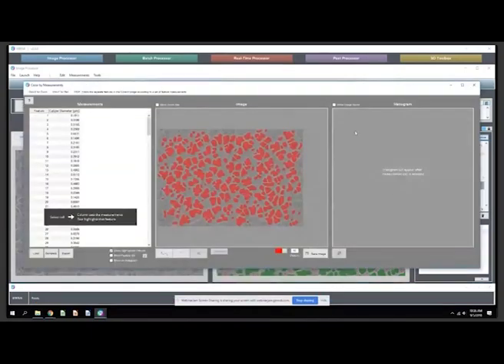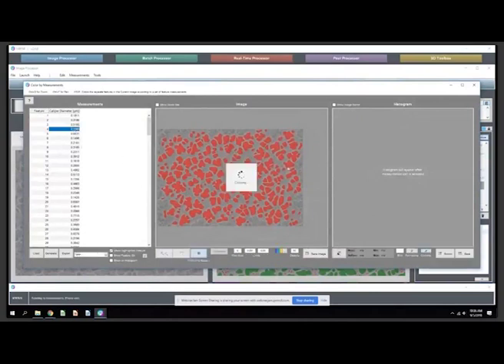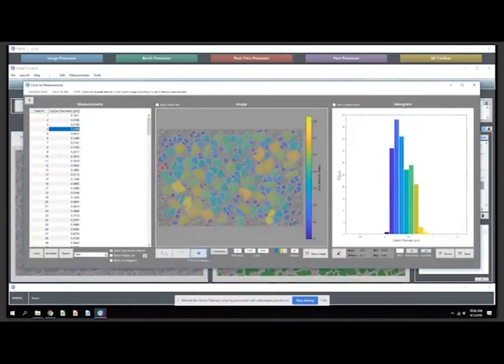Things like curve fitting and cumulative size plots within the histogram. But for now, what you can get here is just the histogram of the data. You can export this count versus bin data into a spreadsheet, and in probably under 30 seconds in Excel, make yourself a cumulative size distribution.